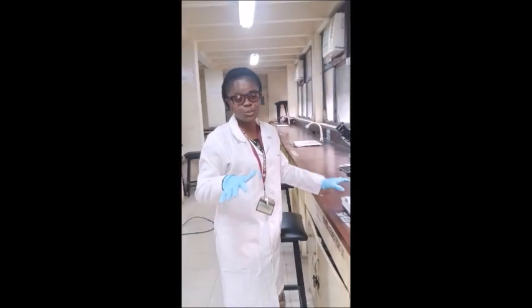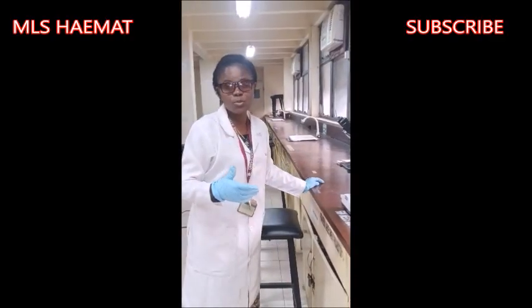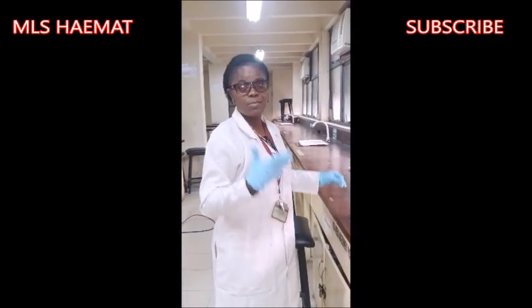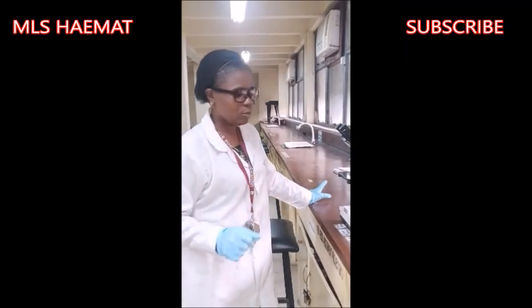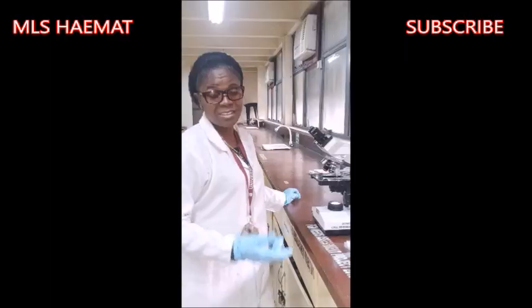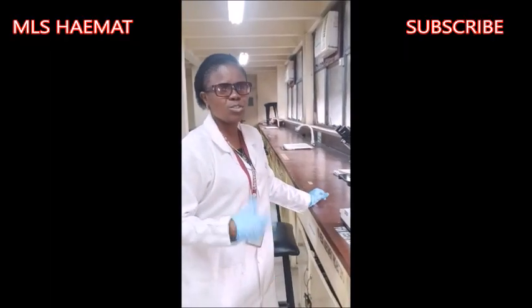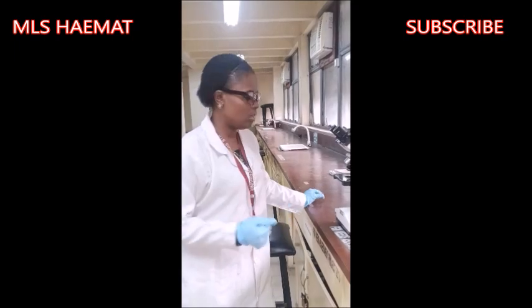To another video session. In this session, I'm going to be teaching you how to focus the microscope. Focusing of the microscope. So you want to make use of the microscope. You have an object that you need to view under the microscope, but you don't know how to go about it. That's what this video is all about.